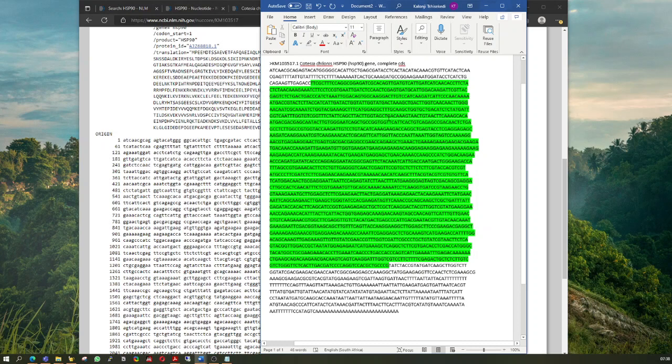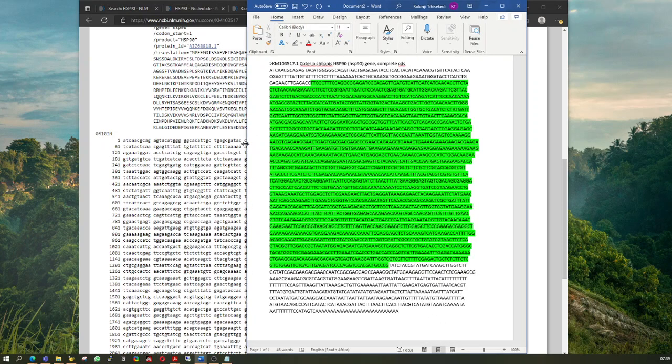If you want to make primers, remember with primers, you're trying to amplify a gene, not necessarily a nucleotide, but you're trying to amplify a full gene. So if you want to design primers, what you want to do is to select the primers that should be a few sequences before your coding region and a few sequences after. That one is going to be very important because it's going to help you not miss any of the important region in green here.